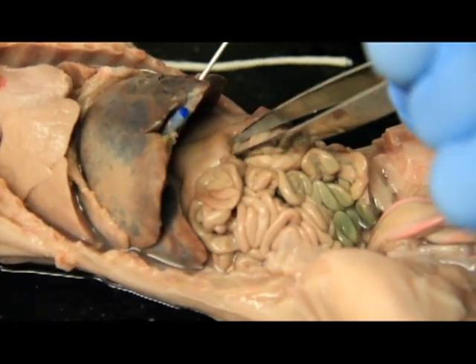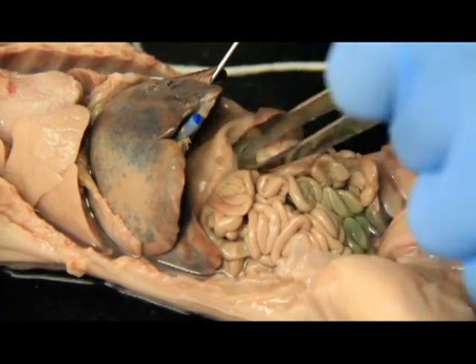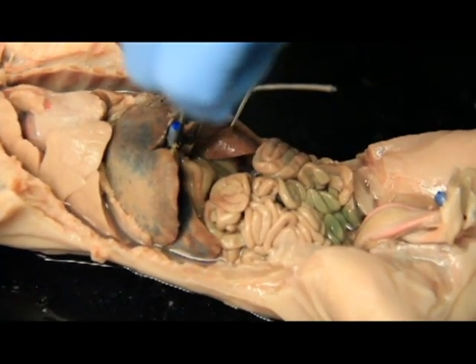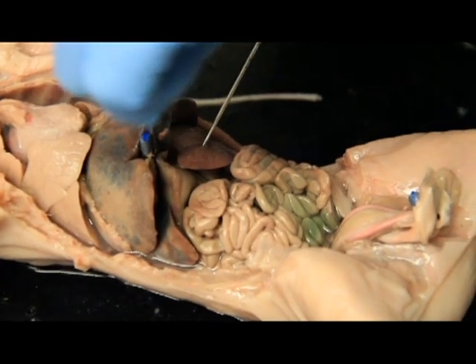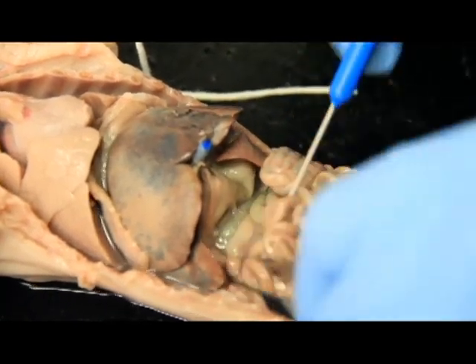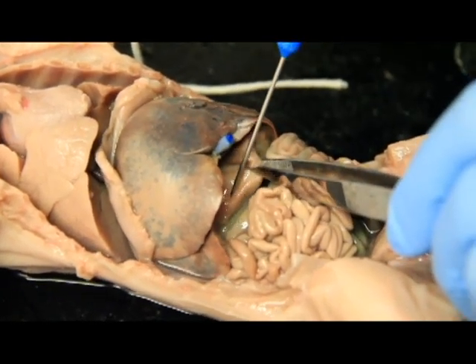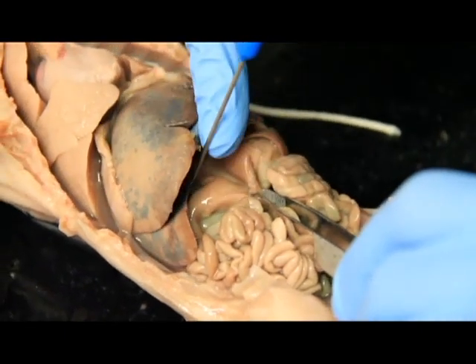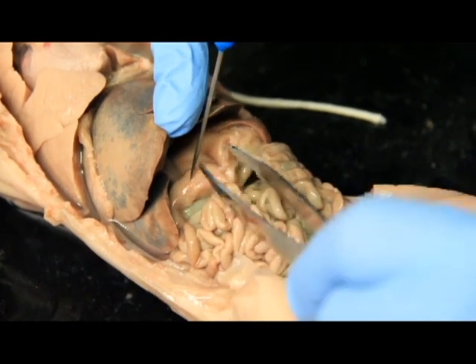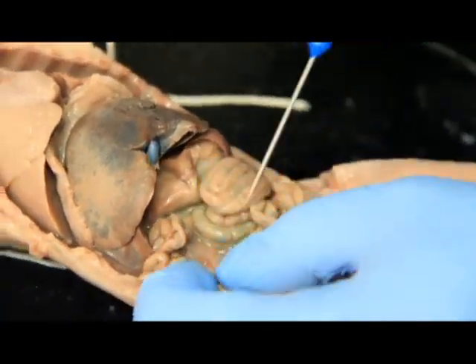Okay? So then on the right hand side here, we've got this deflated little bag. And this deflated bag is going to be our stomach, right underneath the liver. And if we lift that up, kind of right attached to it is this red tongue-looking thing. And that red tongue-looking thing is going to be our spleen. This guy right here. Okay? So then as we move on, this deflated sac is our stomach. This first hard part right here, and you can see how hard it is compared to the stomach, this is our duodenum right here. And then if you follow this down, you can see all of this small intestine.